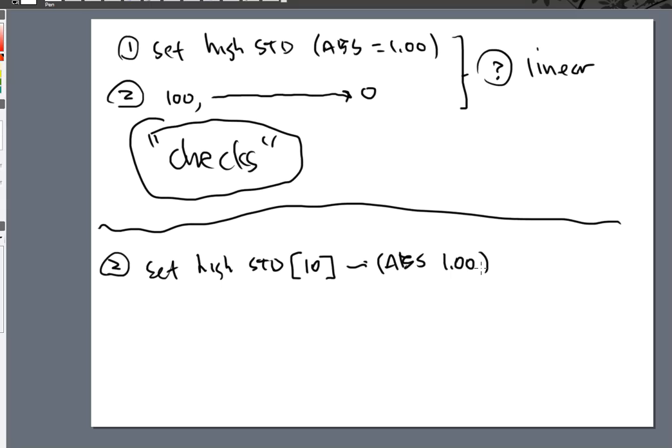So I don't want you to think that we are gerrymandering anything in the instrument or anything in the software by doing this. What you need to understand is that in the emission world, it's got nothing to go off of. It's got no bulb to set itself first. And it uses the highest standard that you are preparing for your lab procedure, and it scales that highest standard to a 1 absorbance. That is how emission works, and that's a little bit different than the absorption.